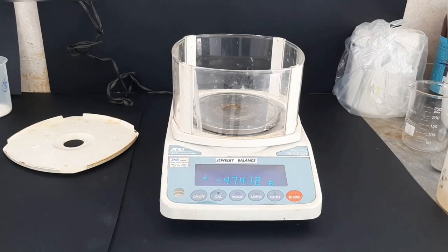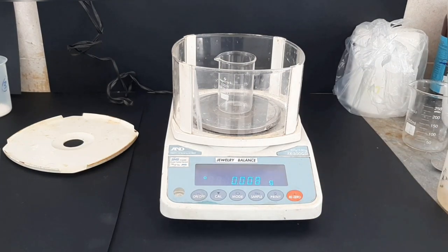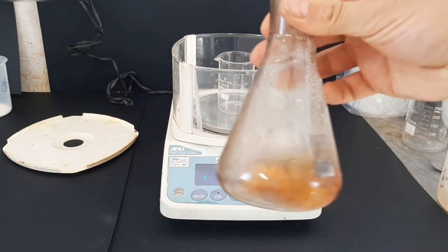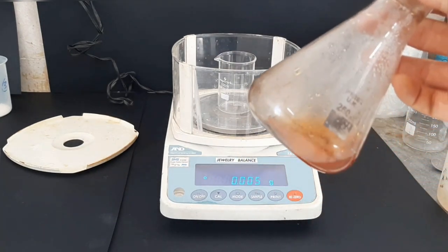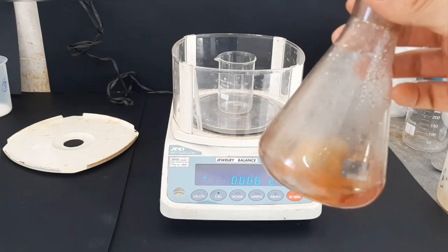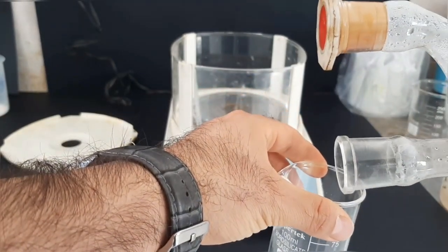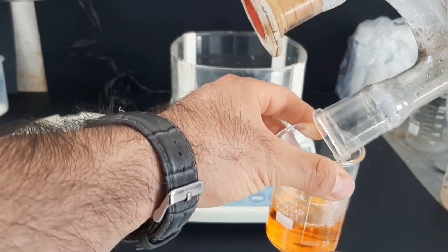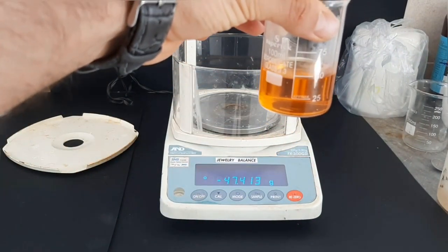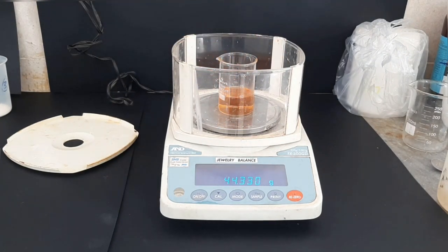So now we're going to measure the residues of the reaction. The residues must contain some water and the sulfuric acid we added as a catalyst. The esterification reaction produces 1 mole of water per 1 mole of ester. So for 2.5 moles of ethyl acetate produced, we have 2.5 moles of water produced. The produced water is around 45 grams, and we removed some of the water in the azeotrope during distillation. There was around 10 grams of sulfuric acid, and that adds up to around 45 grams in residue.